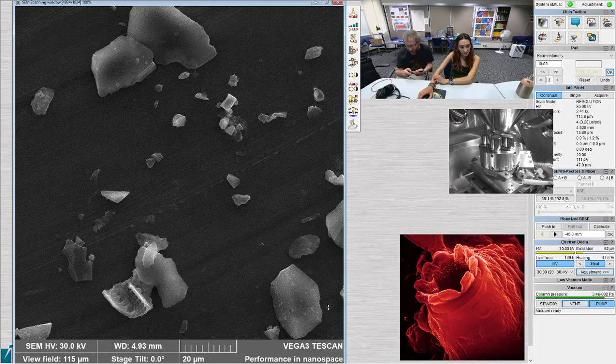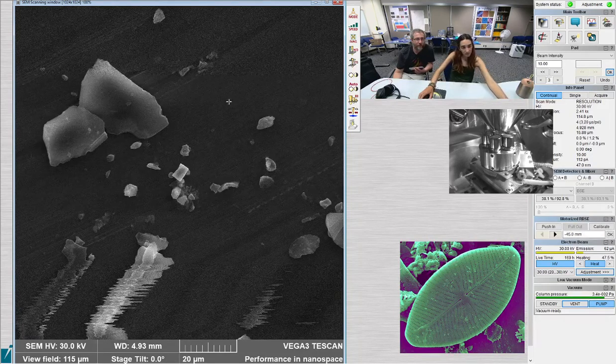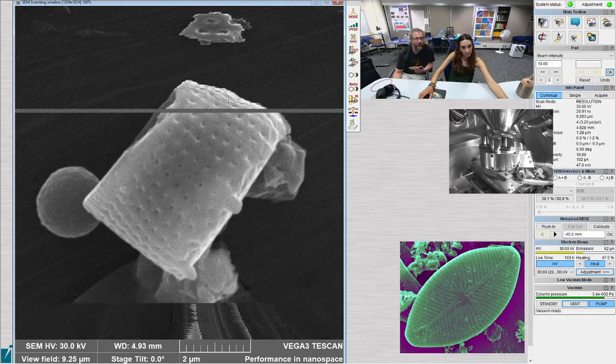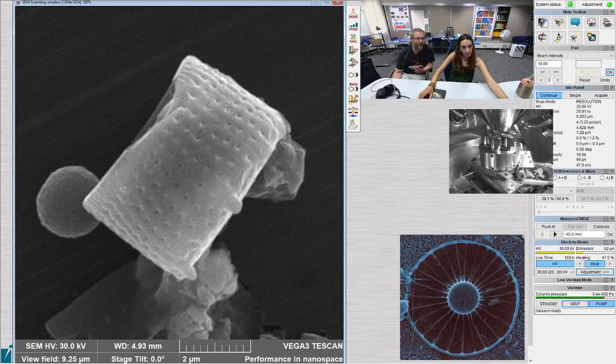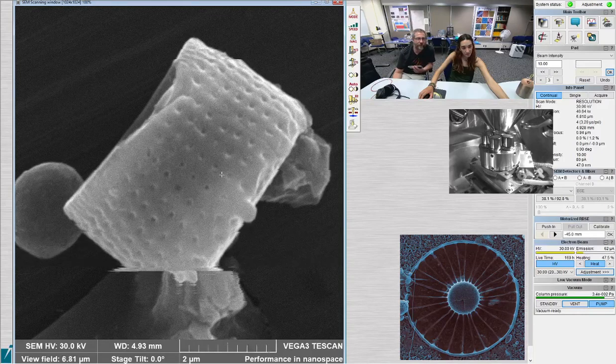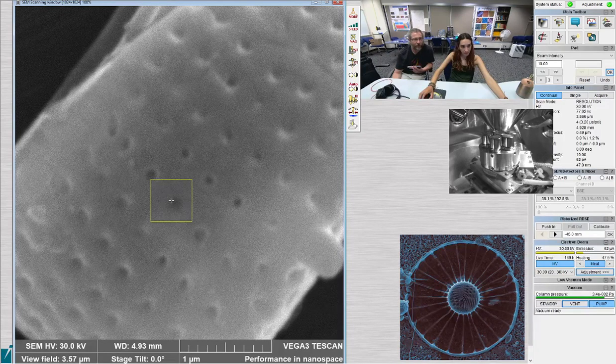So while you look at these, you also catalog each for reference later on. Yeah. Usually what we're doing is going through, doing the SEM collection, and then my colleague Mark Edlund has already gone through these samples, I think that's a different species of Olegocyra, has already gone through and looked at these things in the light microscope and imaged them.